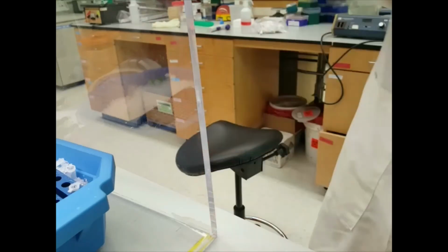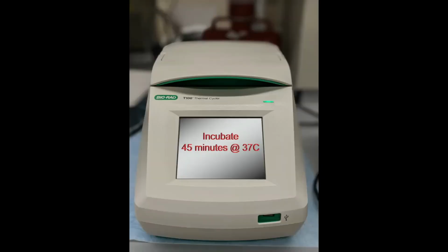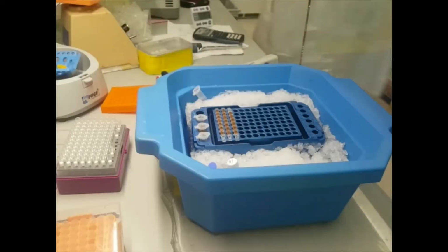Again, mix the samples well by inverting, quick spin and incubate at 37 degrees for 45 minutes. This gives you a nice 35 to 40 minutes to relax or get a coffee until we prepare the bead purification step.